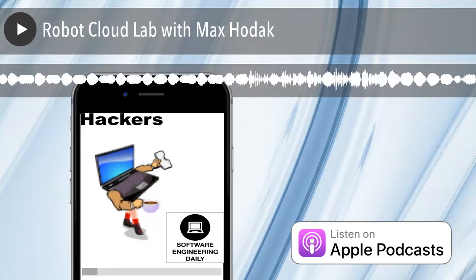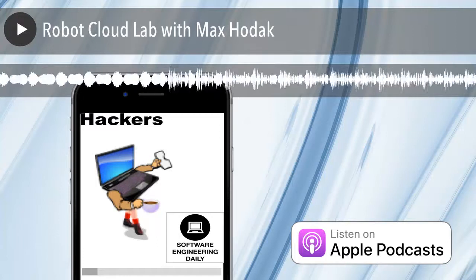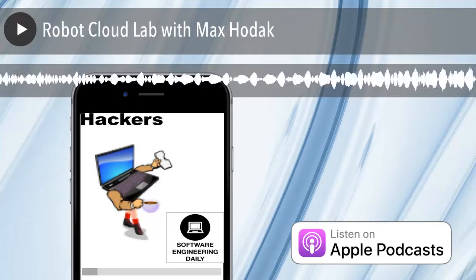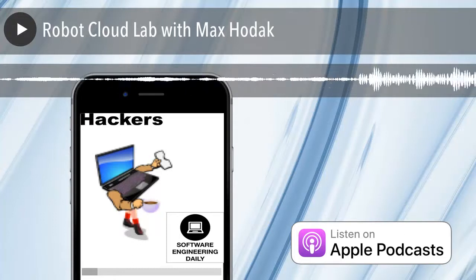Now, I'm sorry, maybe I missed something, but what is the model that you would be testing a drug against here? Would it be a mouse, or would it be some agar solution with cells just sitting on top of it, or how exactly does that testing work? All of the above.